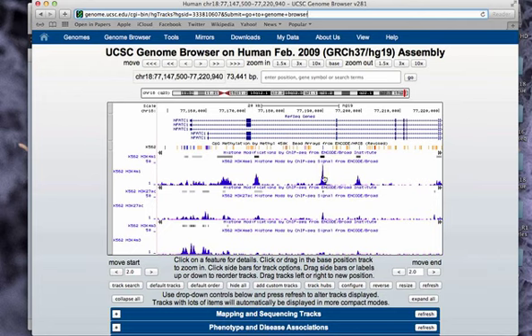This is one example right here of something that is marked by those two, but not the third. And so what we want to do is be able to get all of the data on these tracks. In this case, we don't want the actual signal data, which is these blue histogram plots, but instead we want to deal with the peak data. And this is chromosome start, stop, and we want to be dealing with just those intervals.